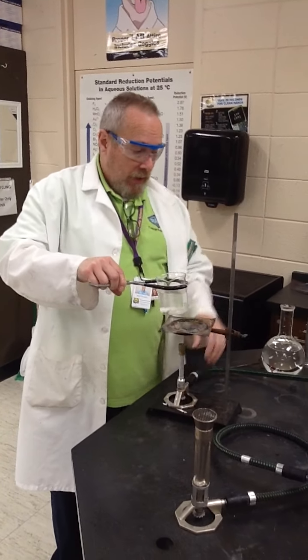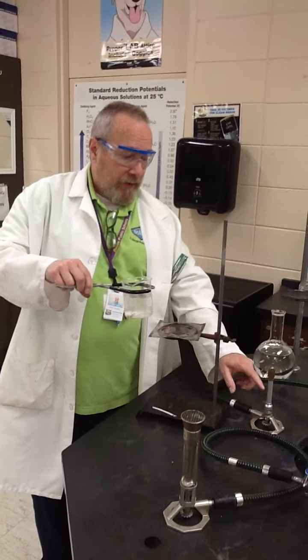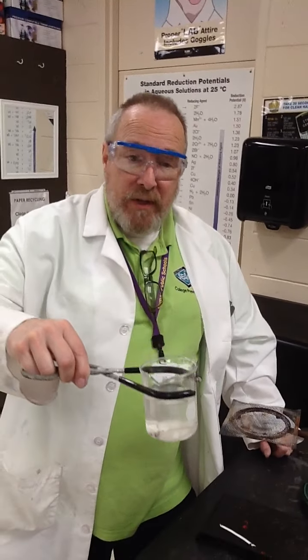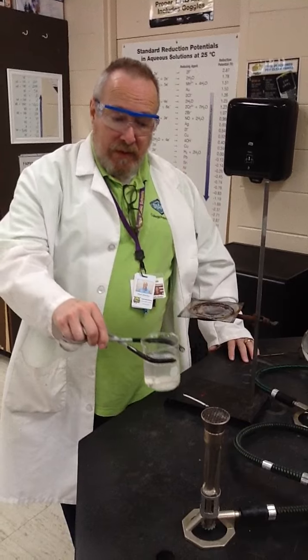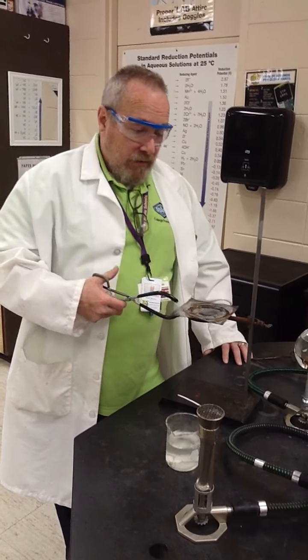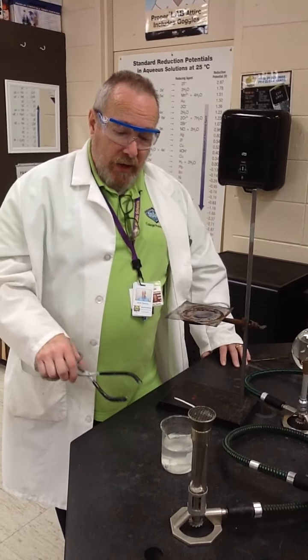It is top heavy. I'll set my burner aside, grabbing it from the hose, knowing that the chimney and the tip are probably hot. I'm holding my beaker with my beaker tongs. I know it's hot because I just saw it boiling, and I also see steam coming out of it. And I'm going to set it down. I have stone tops. You don't want to set it down on top of something that it may damage if it's too hot. And I'm going to leave this ring stand, ring, and wire gauze to cool down for later.